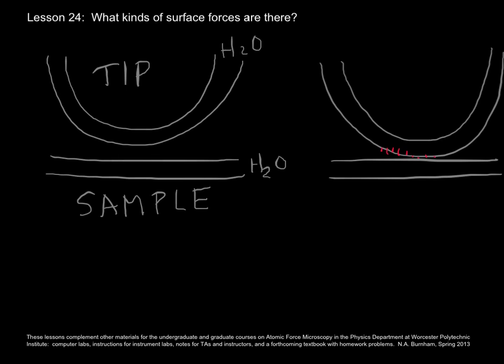And what I want you to notice is that there's a bunch of area right here, the surface of the water, and as soon as the water films touch, those water molecules are going to say, oh, new friends, and they're going to try and get rid of as much area of the surface of the water as possible, because water molecules don't particularly care for air. They prefer each other. So the new profile of the water will be more like this.